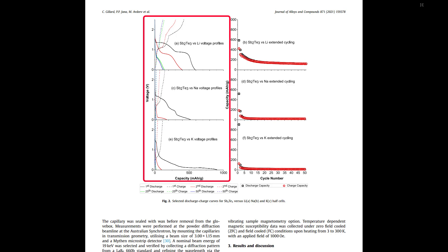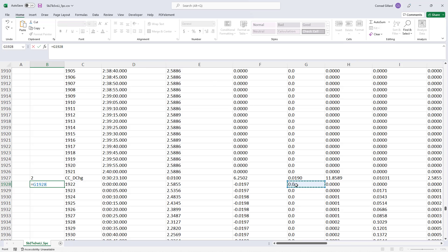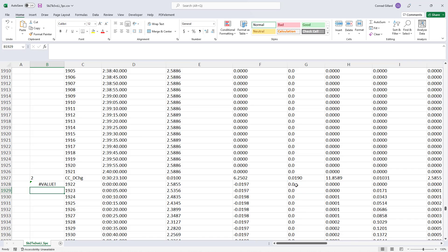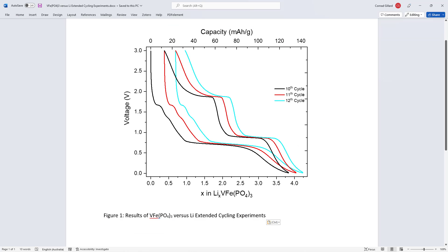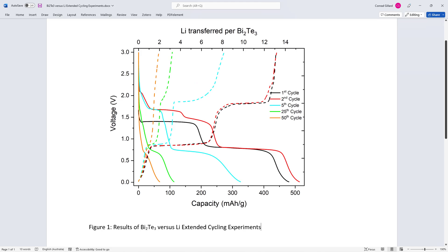Charge-discharge plots are common in battery research papers, such as this one that I previously published. However, developing these plots manually using Excel is a time-consuming and error-prone task. Consequently, I developed a program to automate this process and generate higher quality outputs.